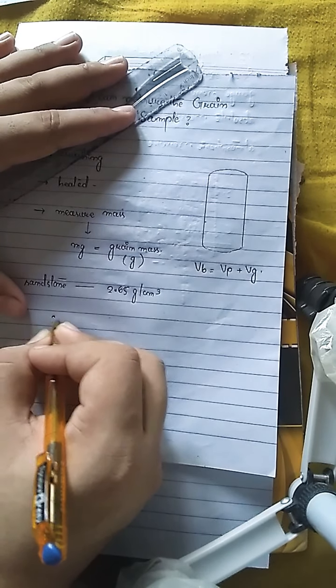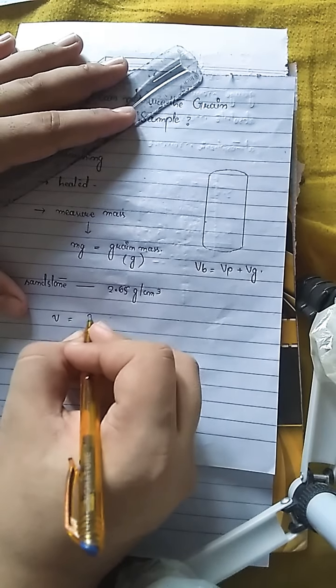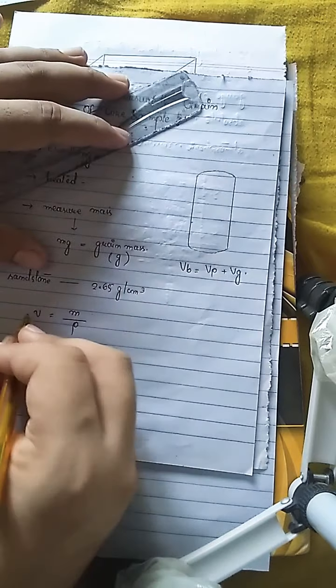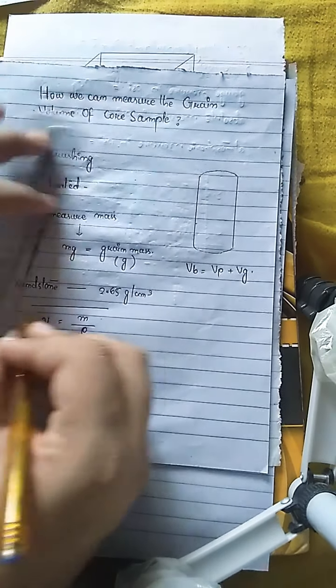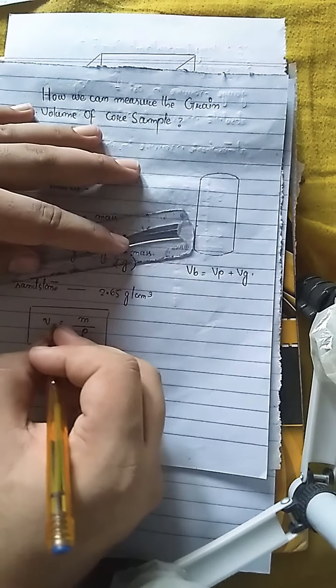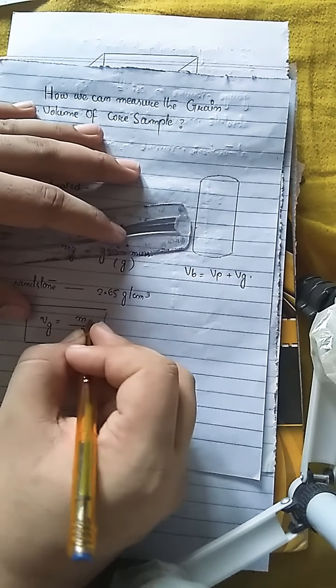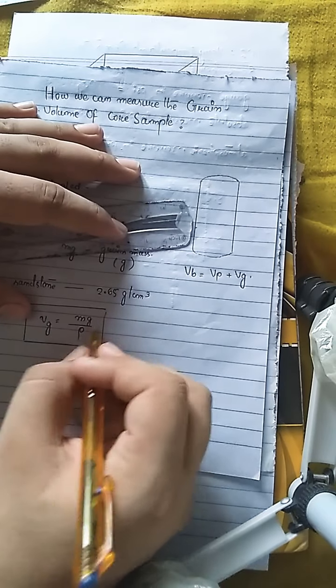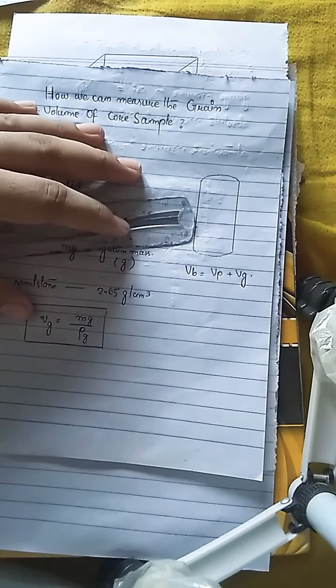by simply dividing the mass by the density, we can get the grain volume of this rock sample. This is basically the grain volume. For this we are using the mass of grains and the grain density.